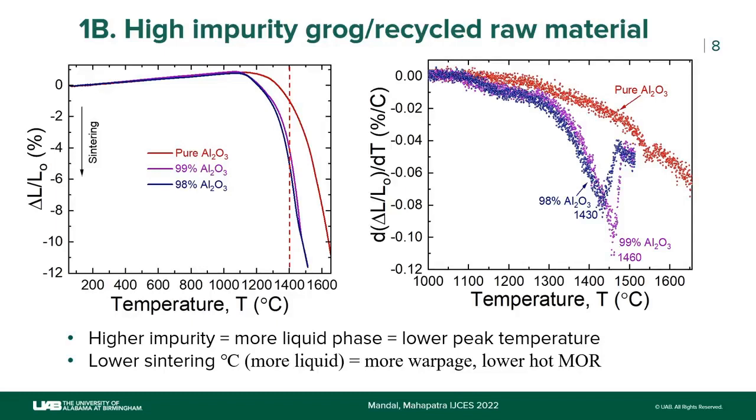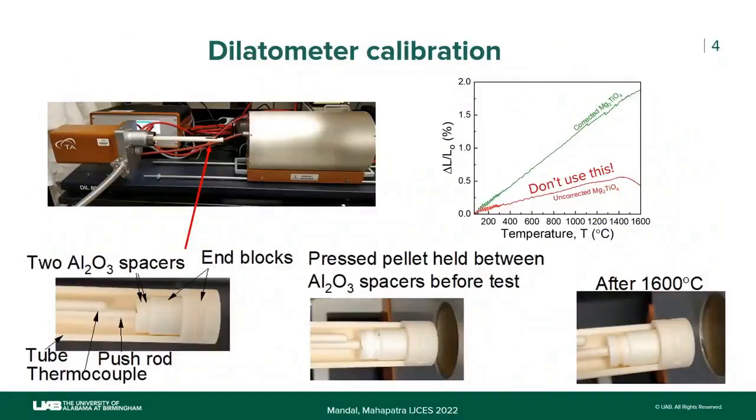Quick question. For those tests, what kind of sample are you using? How do you make the sample? Do you just use powder? This is the sample. This is a pressed pellet, 10 millimeter diameter and 3 millimeter thickness. You should keep the thickness constant. Because you think the way you press this pellet will affect the result? Yes. Here your variable is the raw material chemistry or the raw material particle shape, so you want to make your samples in the same way.